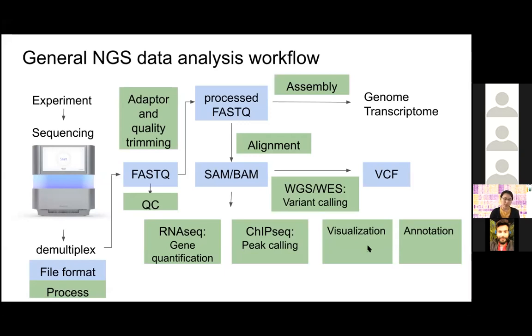Versus a lot of times when we want to make figures, those genome browser screenshots that you might have seen in the previous session of the tutorial, to help people understand our data better. So this is a very, very brief overview of the most common data analysis workflow. And for today's tutorial, we won't be able to cover all of them. However, hopefully I would be able to provide you with a foundation where you can start to explore how to do these different types of analysis in R and in other platforms.